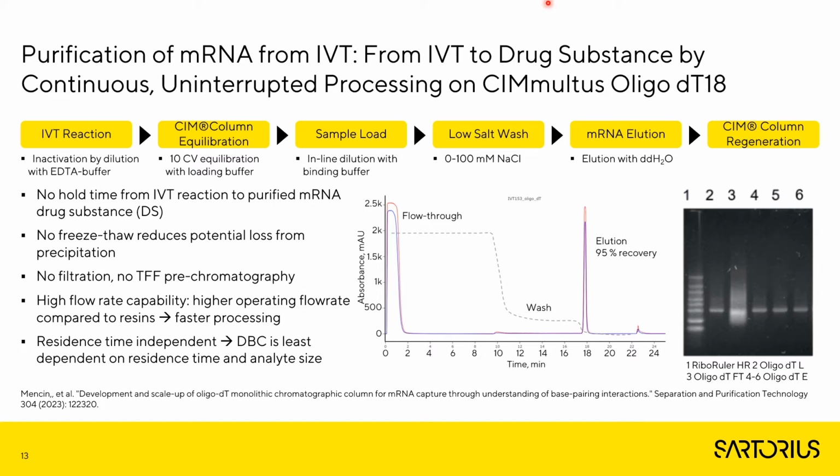One of the key aspects that we always strive to when we develop purification of mRNA is to design a purification process with the minimal holding time between different unit operations and avoiding unneeded steps in the process, like freezing and thawing and implementation of diafiltration and ultrafiltration steps before chromatography. The most optimal workflow we have found was to take an IVT reaction, which we generally quench with some kind of EDTA containing buffer, followed directly by capture on chromatographic monoliths directly from this mixture by adding a moderate to high level of salt, as mentioned before.